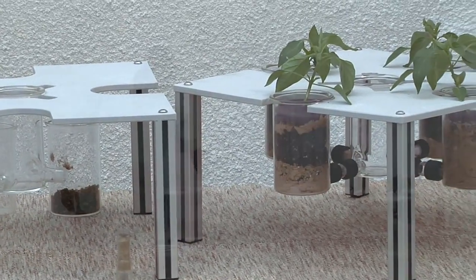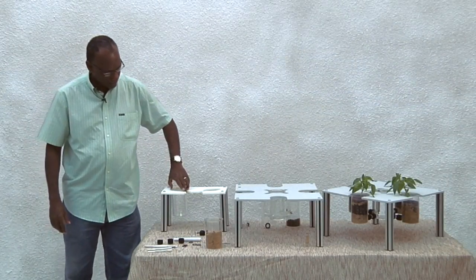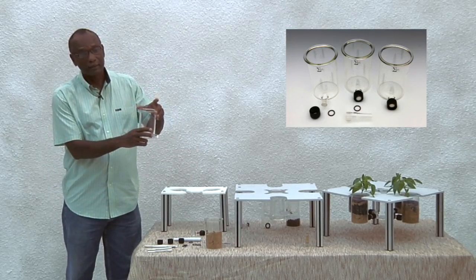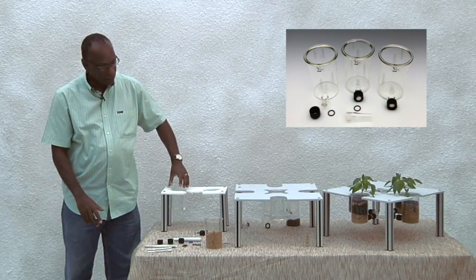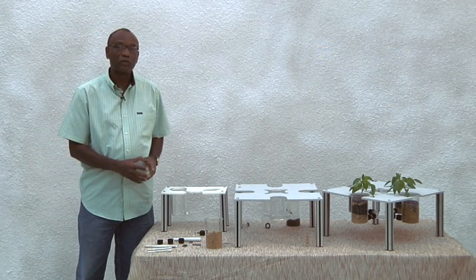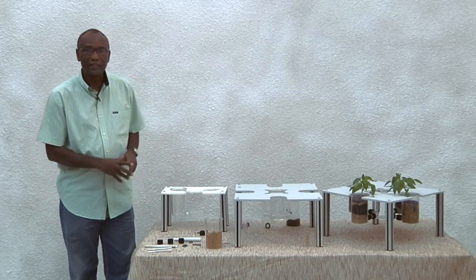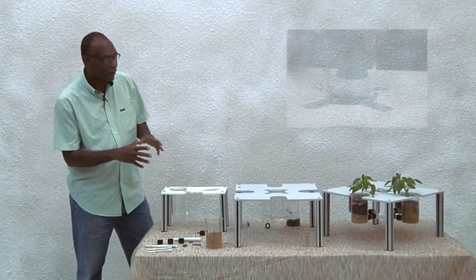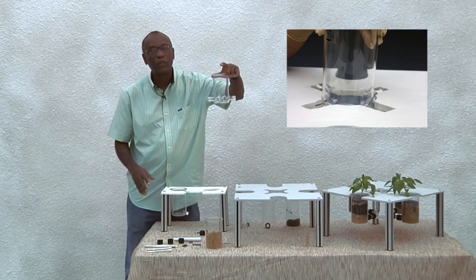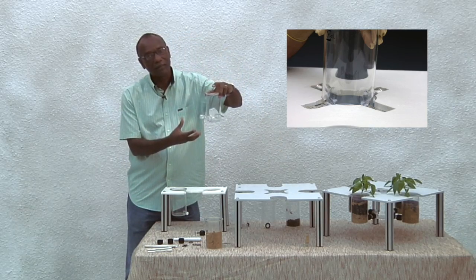The first component is the plant growth chamber, where you grow your plant, insert it into the stand, and allow it to grow for about five days for the roots to develop. The second component of the olfactometer is the nematode induction chamber.